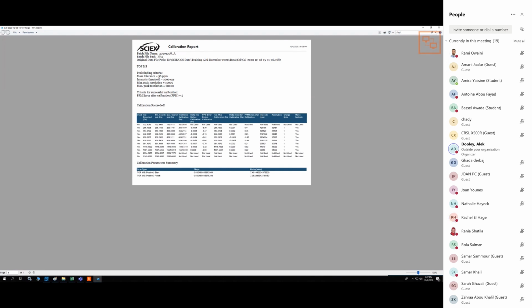What the gentleman was asking is, should we be concerned about this number before the calibration? My opinion is that this is relative to the last time you calibrated it. So who really cares, because maybe that's a long time ago. However, there is a point that if you are calibrating it every hour, this should be correct, and I do agree with that. So looking at this column, you really have to think carefully about the history of the instrument.